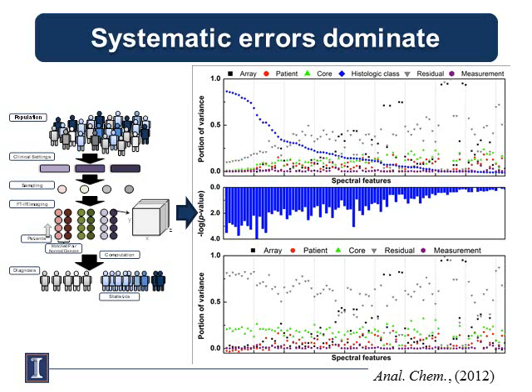And then we ran a very simple ANOVA model on this and said, if we look at the spectral features, so this is a combination of features that one can look at in the entire spectrum, we found that some of them were discriminative for disease, or in this particular case, for cell type in the tissue. So that's the good news. There's a subset of the infrared spectrum which allows us to discriminate between different kinds of cells that are physiologically important in the body.